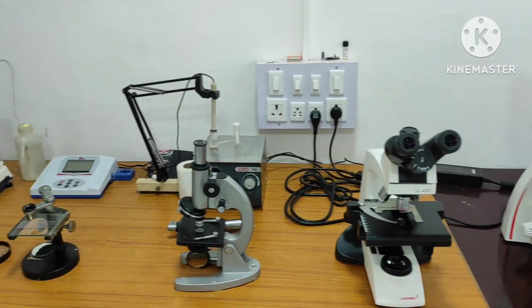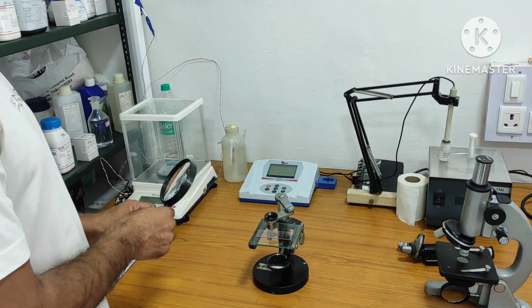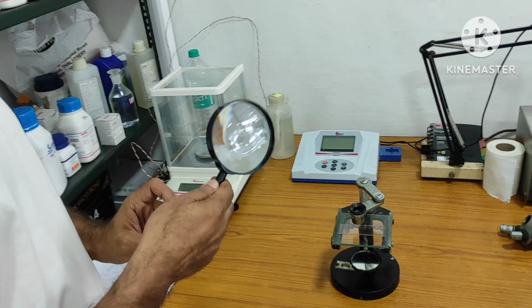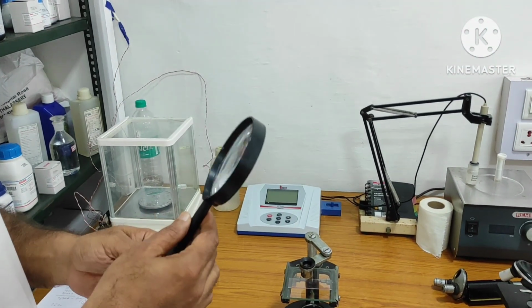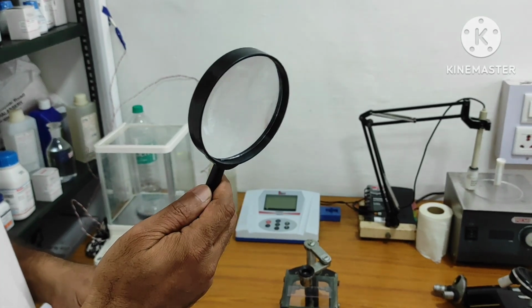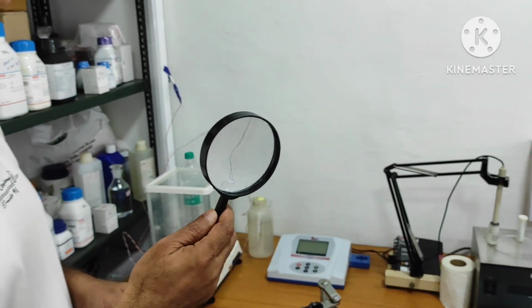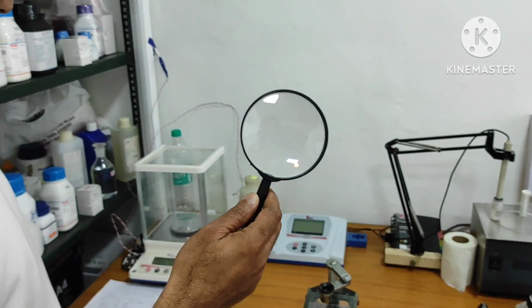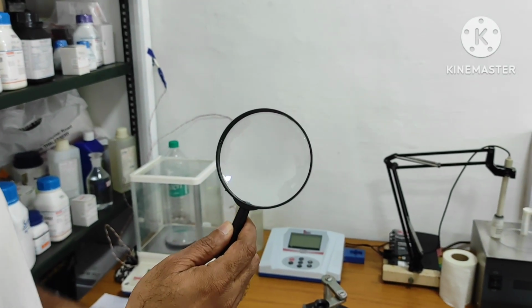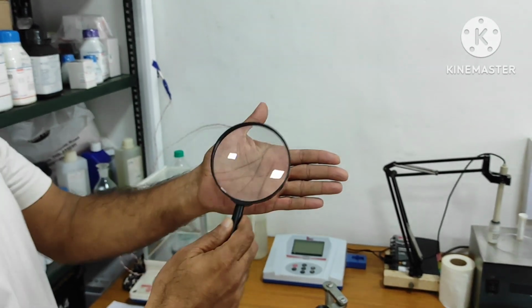So friends, the journey of the microscope started with the formation of lenses only, where we can enlarge an object, right? And you all know about that.